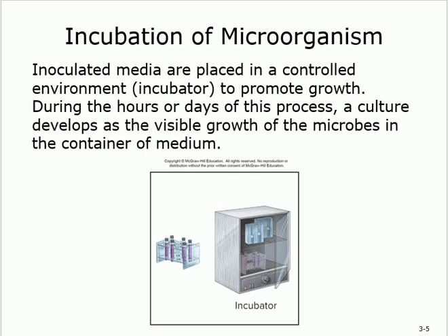How do you know that the time is up and it's good now, you can go ahead and move on? It's the visible changes. So you put it in, and it's, for example, clear purple. And you leave it for the approximate time that's needed. So we're going to study it after a couple of hours, after a couple of days, whatever it is, depending on the species.